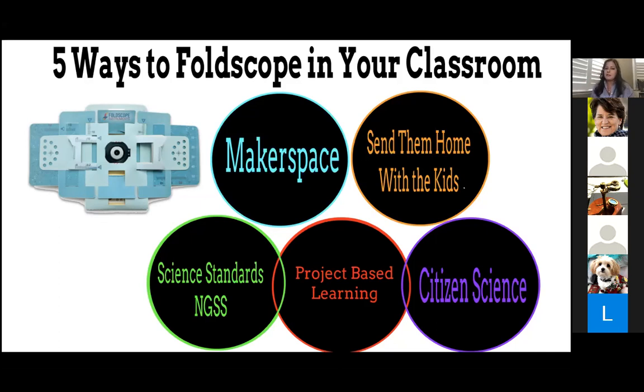So she makes me the slides, and she decided what wings would be in the slide library because of how different and unique each wing is. So the key is that kids can visually recognize the wing of the psyllid. So no, I don't take anything off the traps. She makes me the sets of the slide library.